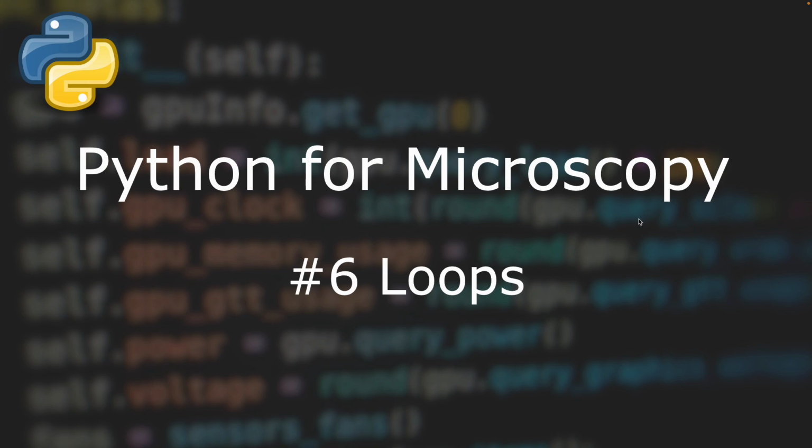Loops are used to repeat certain blocks of code within your script, and we have different options in Python, for example the while loop, the for loop, and also specific statements to modify the control flow.